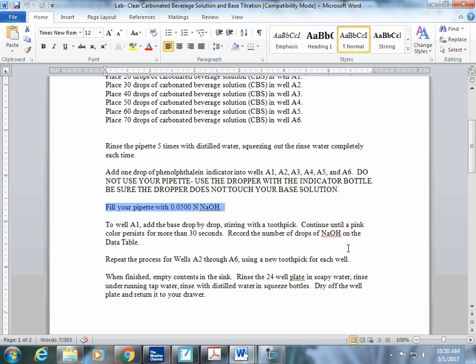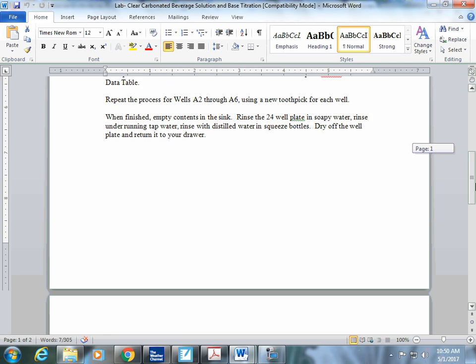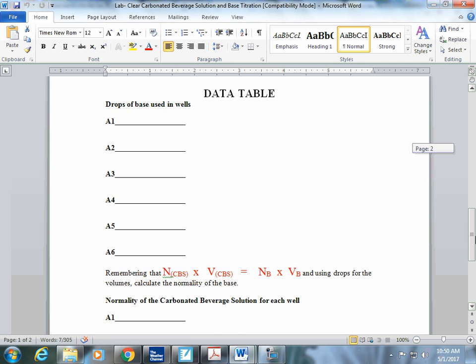All right, so we repeat this procedure for A2 through A6. When you're finished, you can empty the contents of the well plate into the sink and clean the 24 well plate like we have been cleaning. Now let's get to our calculations.